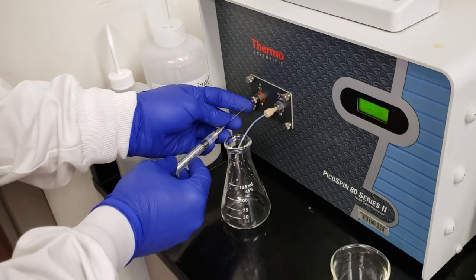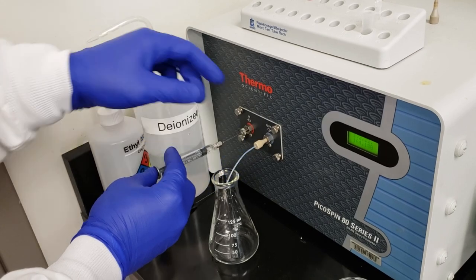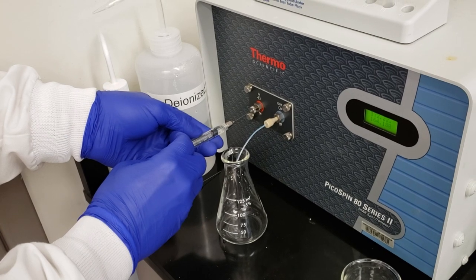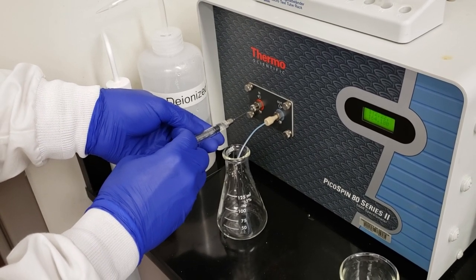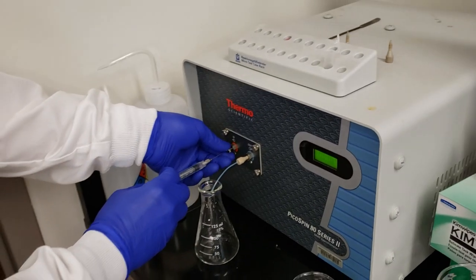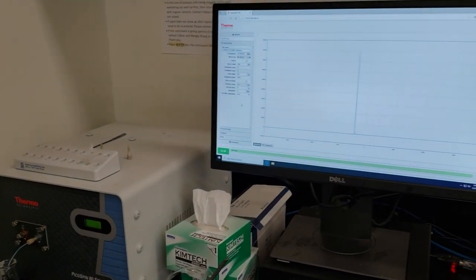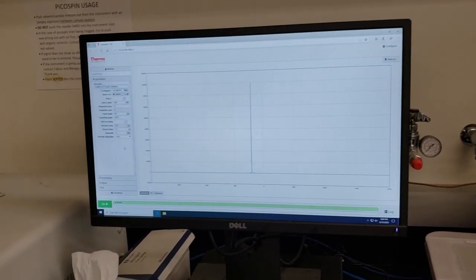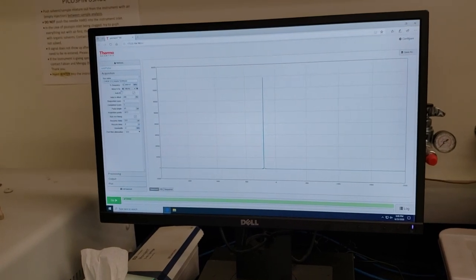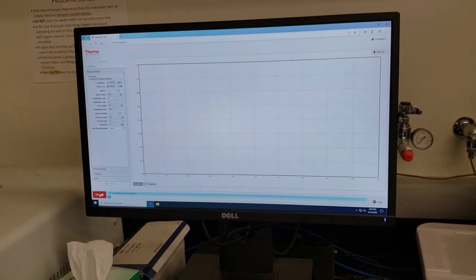I'll open up my inlet, carefully insert my needle, close it down, and then we're looking for 10 drops coming out of our outlet tube here. That's more than 10 drops. So we're all set. That just tells us that our loop is filled with our sample solution and we're ready to start our run. We're set for 8 scans. We've named it CHEM 2212 Amide Synthesis. I'll go ahead and click go and we'll see what our spectra looks like.